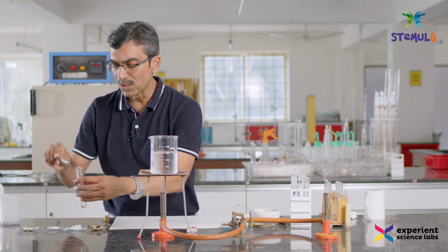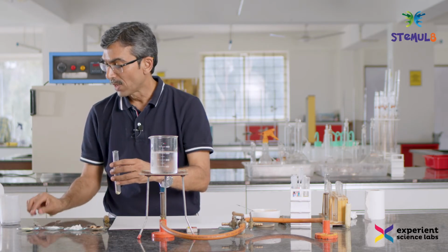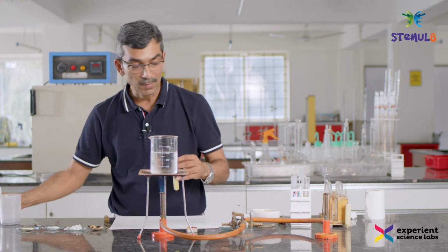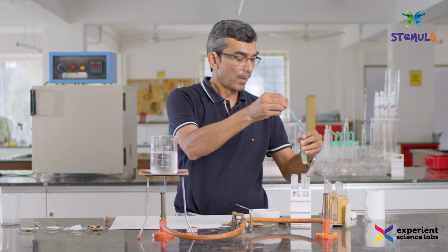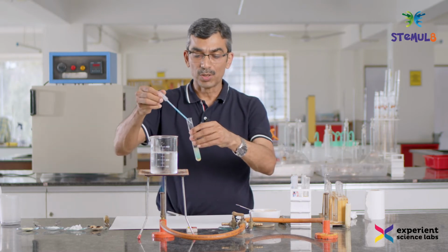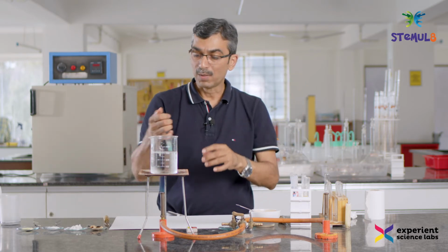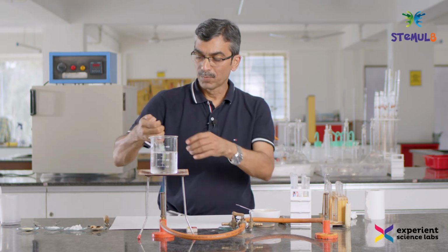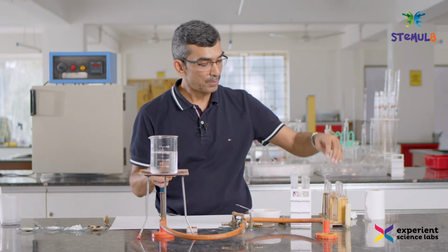Again, I will repeat that this is not exactly the process by which it is carried out in food laboratories. We are doing just a qualitative assessment of whether the things are present or not. So this is fine for that. Moong dal has its own color, a bit greenish, so it becomes a bit lighter here. But this will be our starting point, right? Let me mix it up also, and I will let this solution settle down for a while. In the meantime, I will prepare the sugar solution.